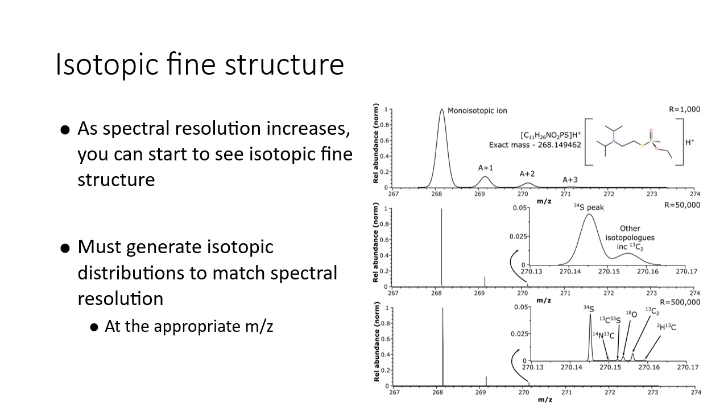For a molecule as dangerous as VX, it would be common to use more than one method to confirm its presence in a sample. After all, even if the formula proposed by the accurate mass methods is correct, it's still only the empirical formula and it tells you nothing about the molecular structure.